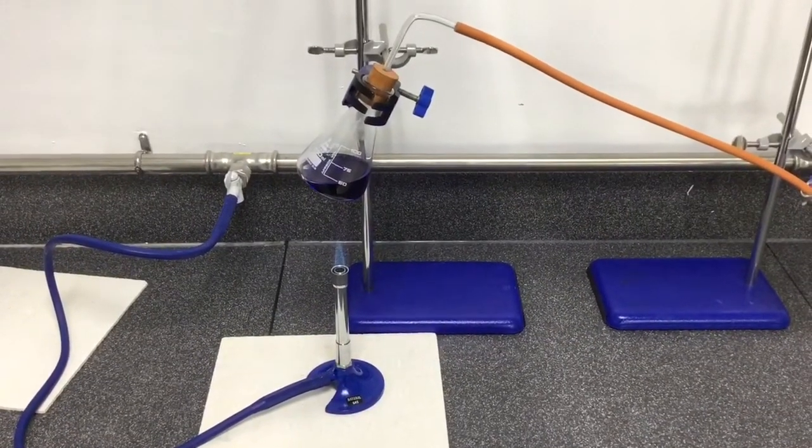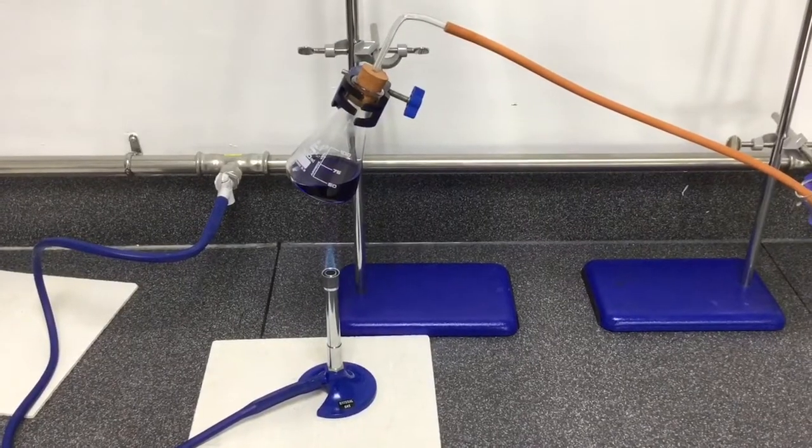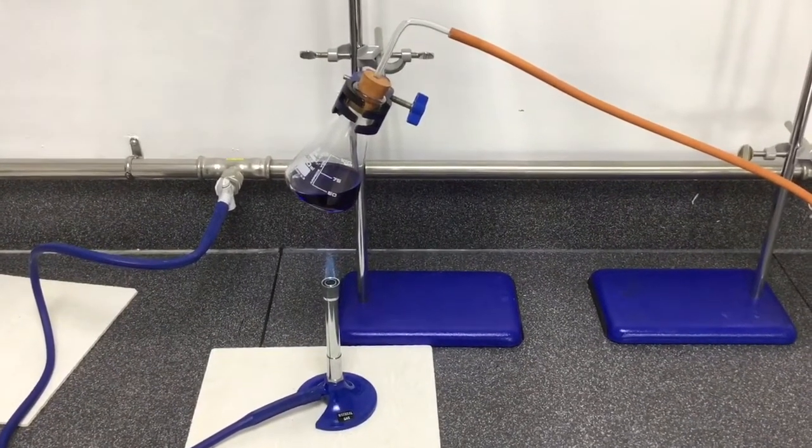We can then begin to heat the inky water mixture using a Bunsen burner. This will cause the water in the mixture to boil before the ink.